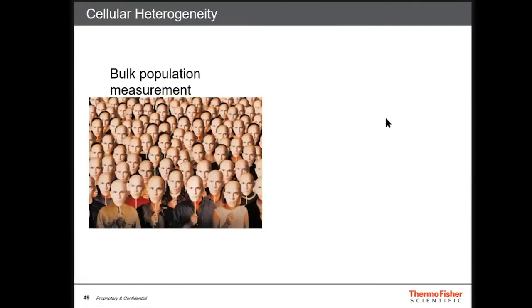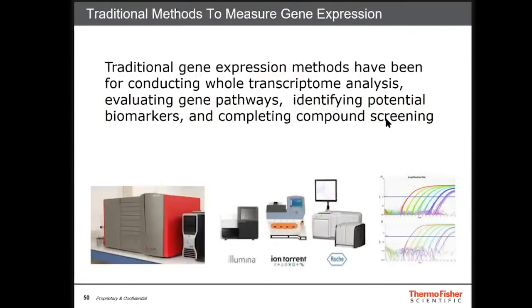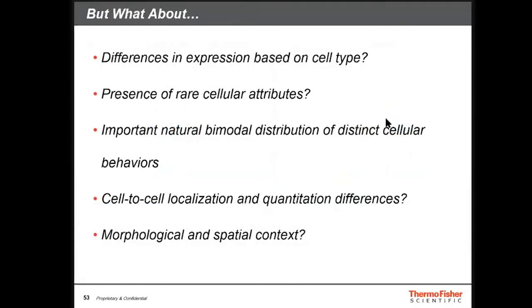Okay, thank you. So we've been talking so far about bulk measurements, averages across cells or tissues. But what about single cell analysis, and why would that be important to you? Sometimes you need to know more than what the average is. You need to know if different cells are expressing differently within a population, different cell types, and also you might need spatial information within cells or within tissues about where expression is occurring.